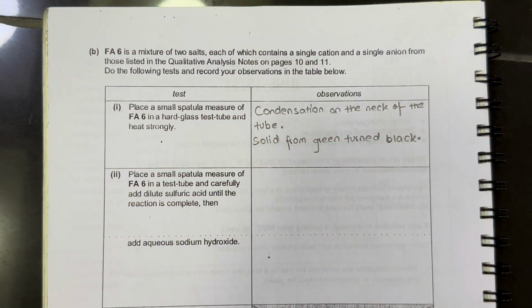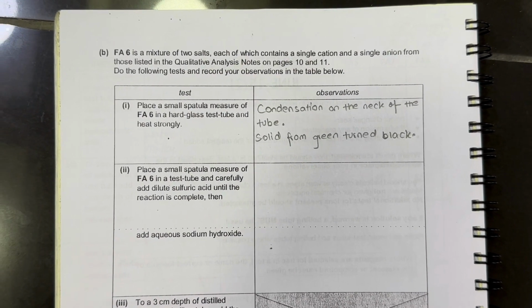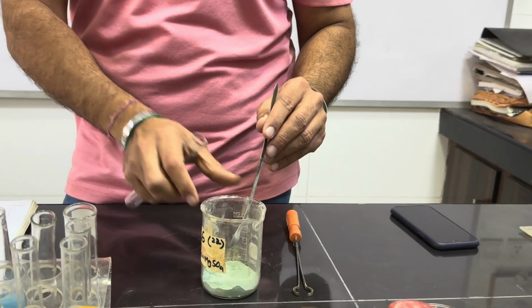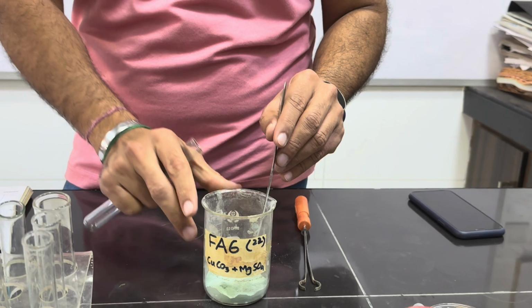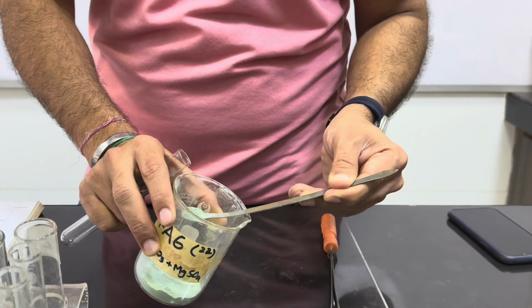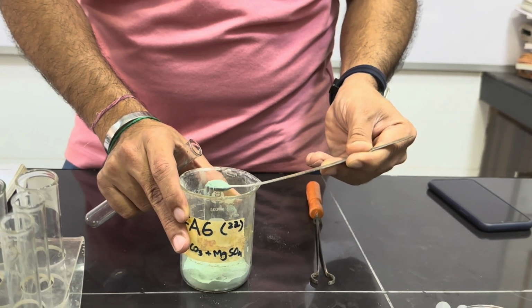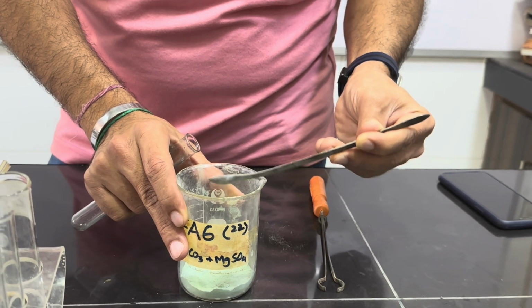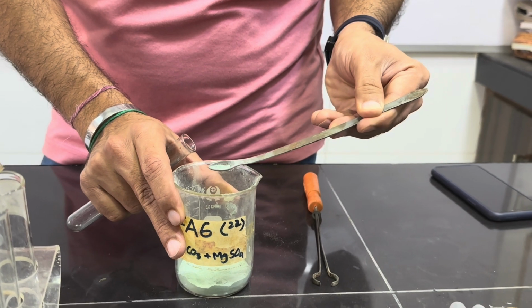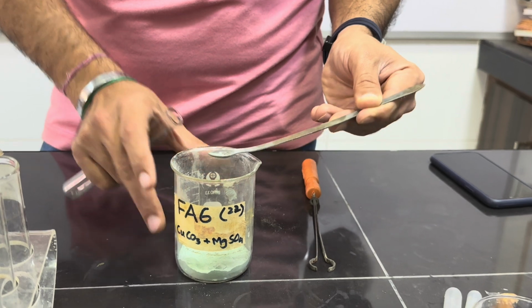Next test says in a small spatula measure of FA6 add sulfuric acid followed by sodium hydroxide. Now we will take a small spatula of FA6 in this test tube, but before we take a small spatula, let me tell you about the small and full spatula. If we take this way, it's a full spatula, and if we drop most of the content and take just like this, it is a small spatula, even lesser than this. So this is what we call a small spatula.